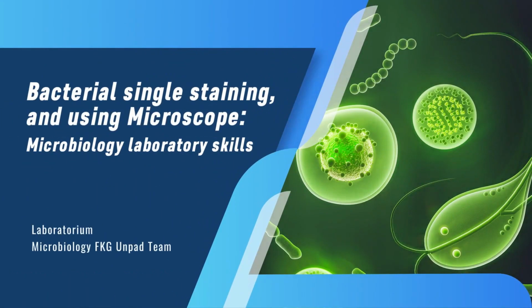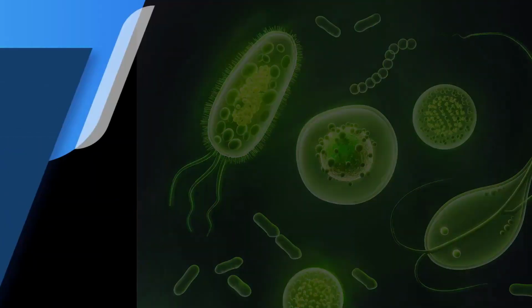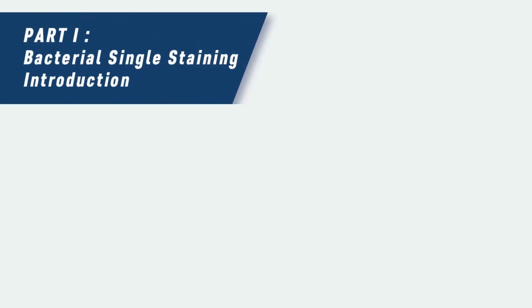Bacterial single staining, and using a microscope, microbiology laboratory skills. Part 1, Bacterial Single Staining Introduction.